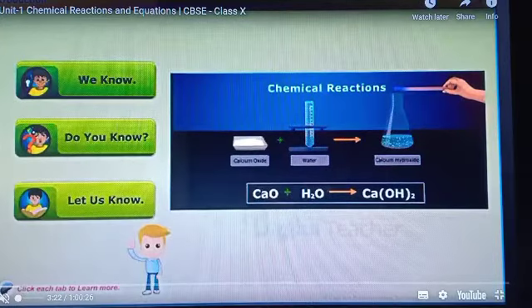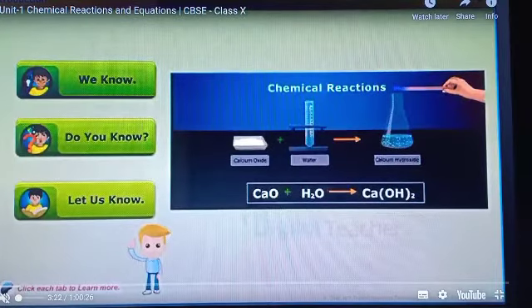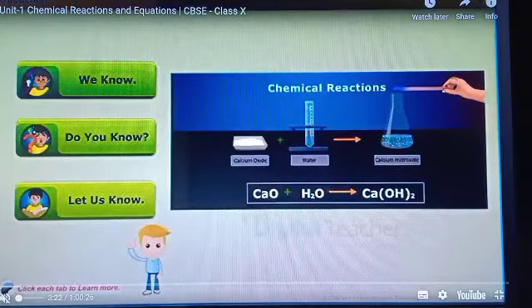In this video we will see the activities of chapter 1. These activities are very important because many questions are asked from them in the examination. So we see the first chemical reaction, which is the exothermic reaction.